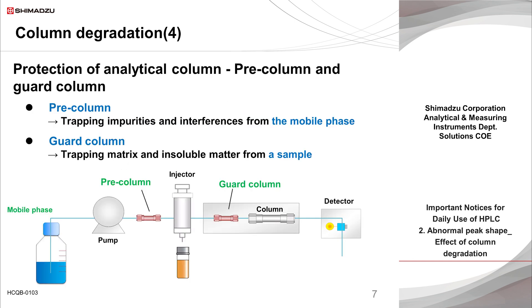In addition to the general concerns about column handling introduced in the previous slide, protective columns are sometimes used to delay the degradation of the analytical column. There are two types of protective columns. A pre-column protects the analytical column from impurities in the mobile phase, while a guard column protects the analytical column from impurities in the sample solution. The pre-column is placed between the pump and the sample injector, as shown here.